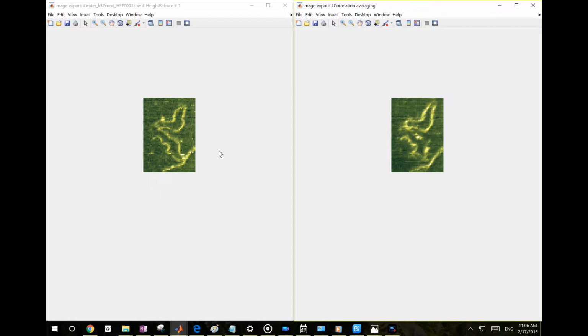You see that the template and the average result are not exactly the same, and the average result is kind of truncated there, which means that for the DNA molecule, there's some dynamics in that region. That's why it's not added up. Instead, they kind of cancel each other. That means there's some dynamics, at least at that area of the DNA molecule, that specific arm there.